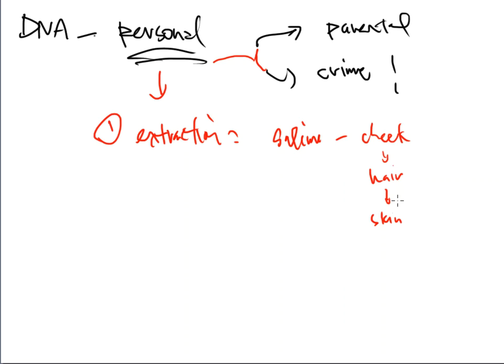So for this reason, number one, we are using real DNA samples for a change, when the other two, not so much. At least not from the perspective of a real DNA sample coming from someone. So in this experiment, we're actually going to be extracting and handling real DNA. To make it a little bit safer in the laboratory, we're going to allow you to analyze the DNA you have gotten from your cheek cells by swishing your mouth with our salt solutions, spinning them down, centrifuging them, bursting your cells open, and then eventually going into the PCR step.